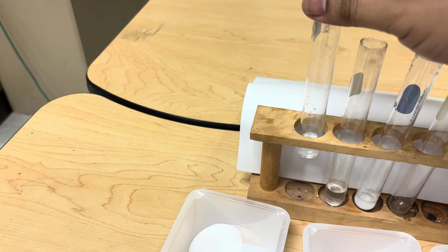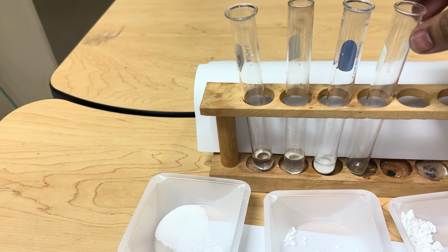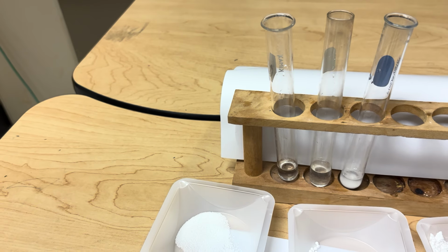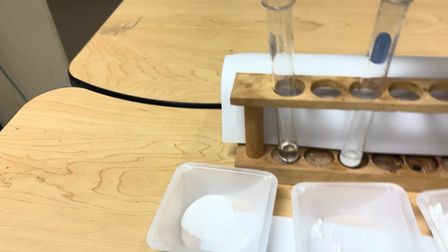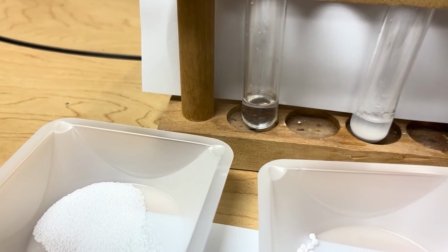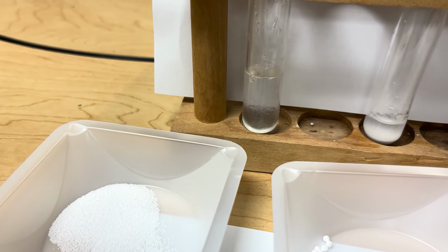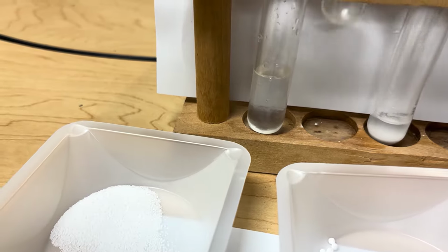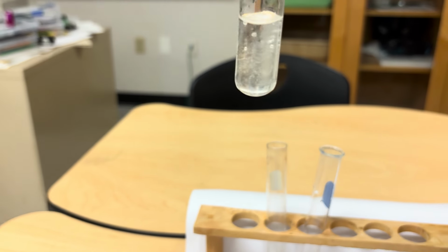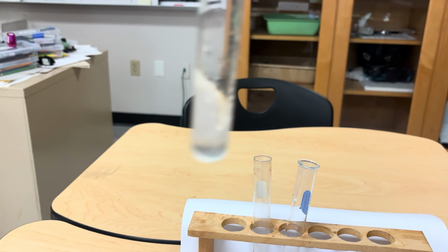Well, actually, I don't even need to do that, do I? I can just pour one into the other, and that'll be my 4th test tube. So I'll pour this in here and we'll see what happens. All right, you ready? Here it comes. All right, and we'll swirl that around to mix it up.